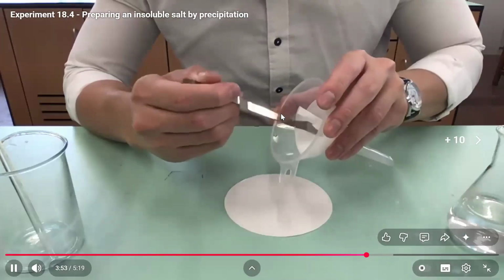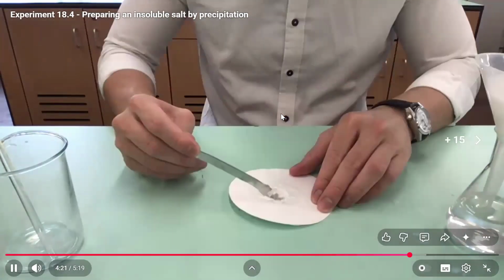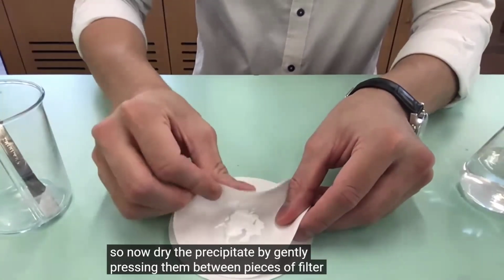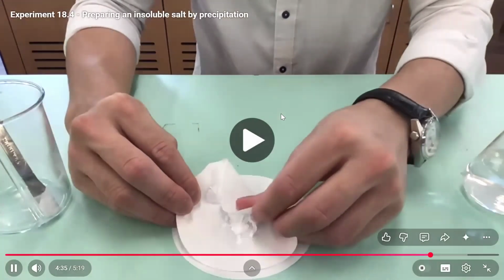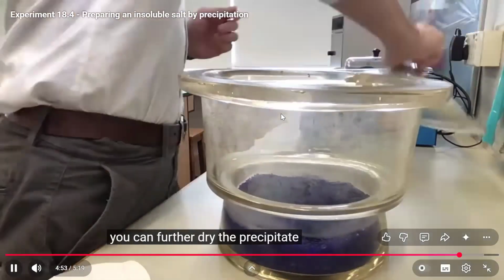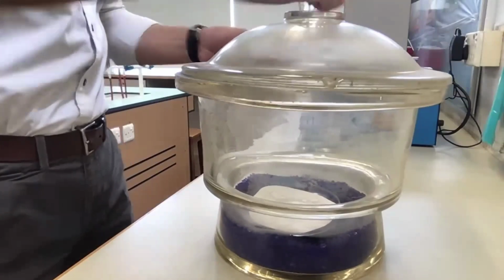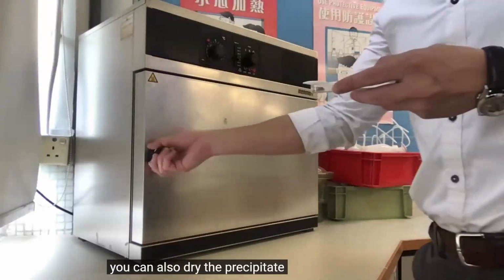अब these are the precipitates. Now they're just going to dry between the filter paper like this, ठीक है। Dry the precipitate by gently pressing them between pieces of filter paper. Dry between the filter paper भी कर सकते हो. You can place these precipitates in the warm oven or the desiccator. You can further dry the precipitate by putting it into a desiccator. ठीक है, or you can put it into a warm oven, right? You can also dry the precipitate in an oven.